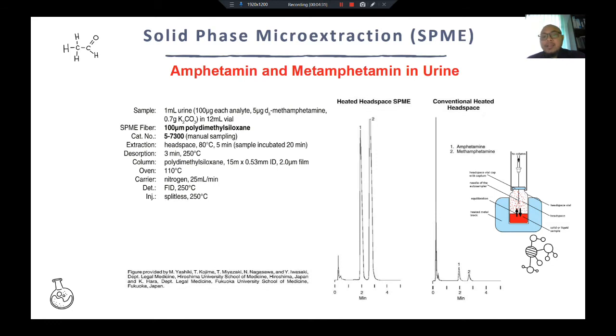using the SPME, okay. Here is the heated headspace SPME, yang macam saya kata guna SPME fiber, or conventional heated headspace. Okay, conventional heated headspace ni apa? Okay, maksudnya instead of we inject directly, okay, the solvent, kita sedut kita punya sample masuk dalam GC tu, kita inject, okay. Instead of that, kita just inject apa yang ada dekat udara ni saja, tapi kita apply heating lah dekat this particular vial. So our analyte of interest yang volatile je akan evaporated. Okay, yang ni kalau kata kita guna conventional heated headspace, itu macam mana.